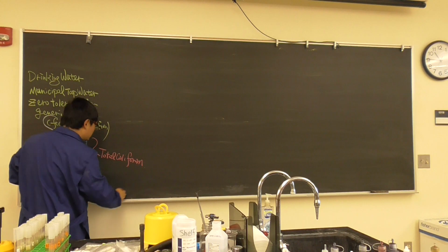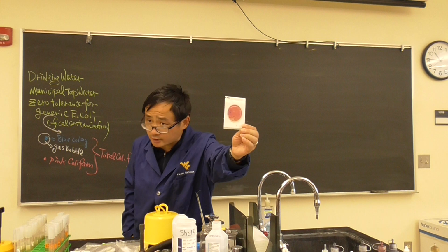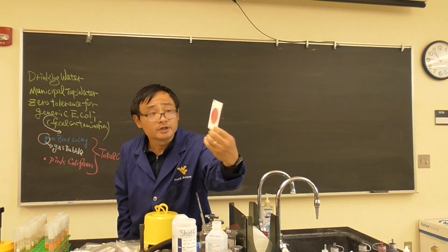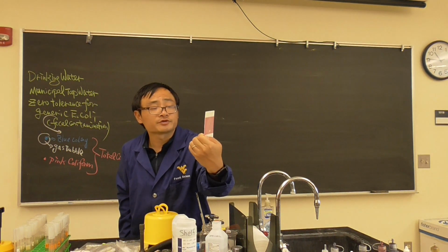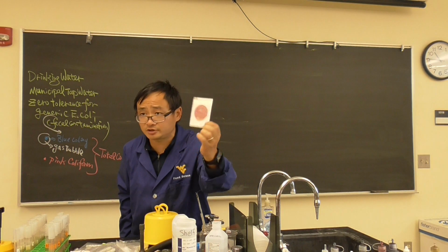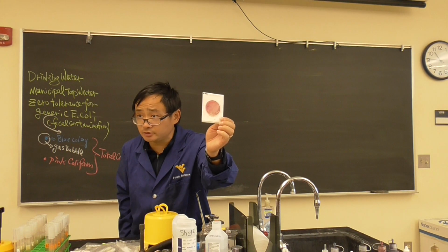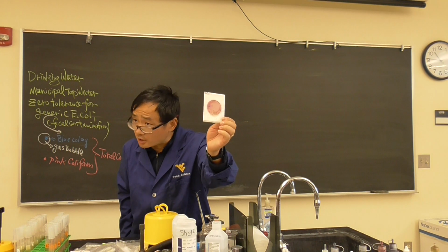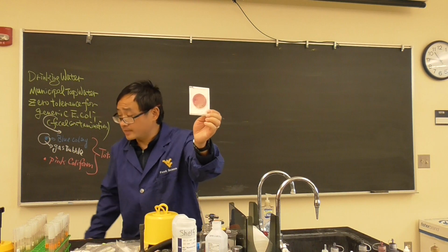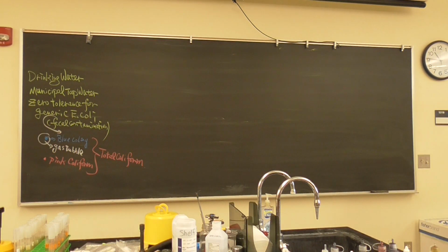And you can see even our WVU pond water, the coliform is actually pretty huge. Let's say this is 10 to the second, 100, you see at least like 15, 20 cells there. That means there are 100 generic E. coli and pretty much 3,000 coliform there. So that's important to tell you something. Okay, they did a good job. Very good job.